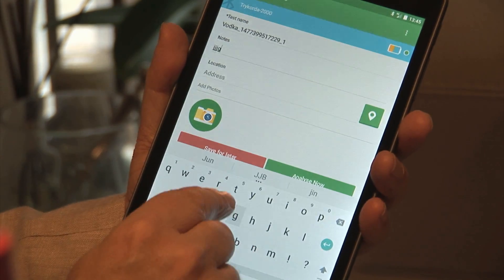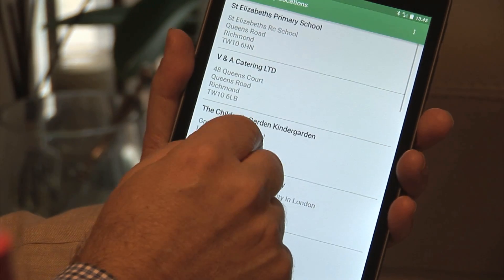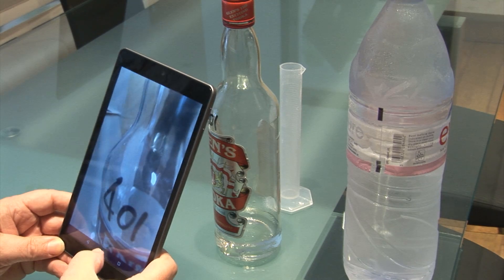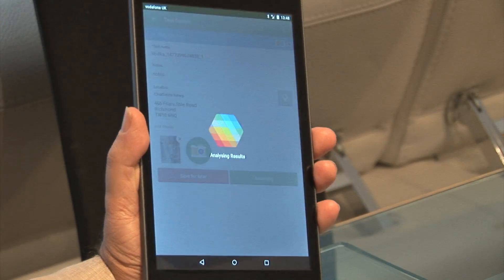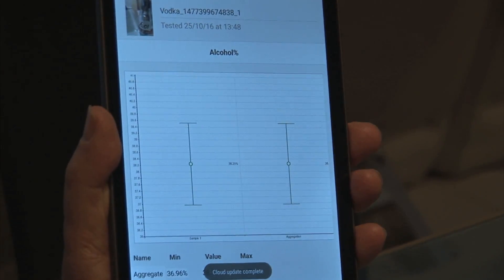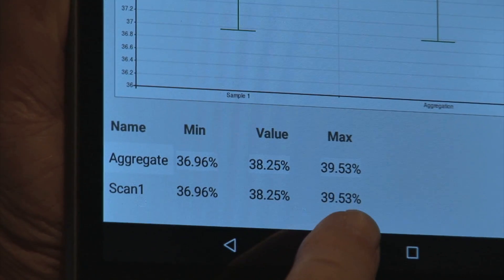As you can see it takes a couple of readings, and from there I can enter some details about the test. We can select the location where the test is taking place and we can take a photograph of the sample so that I know which one it actually is. Once I've done that we can analyze it and we can see the results straight away — it's between 36.96 and 39.53% alcohol. Fantastic.